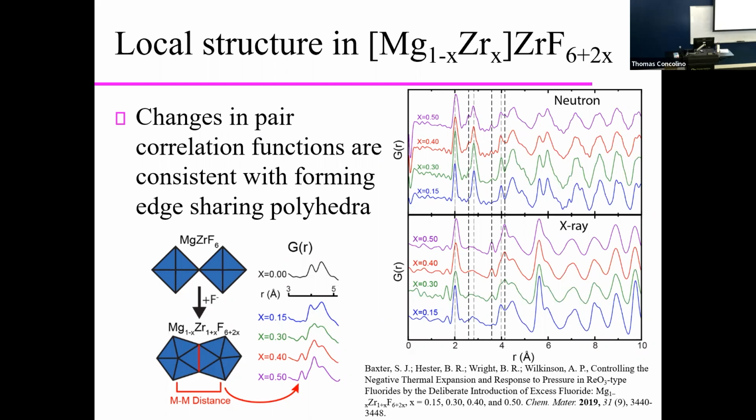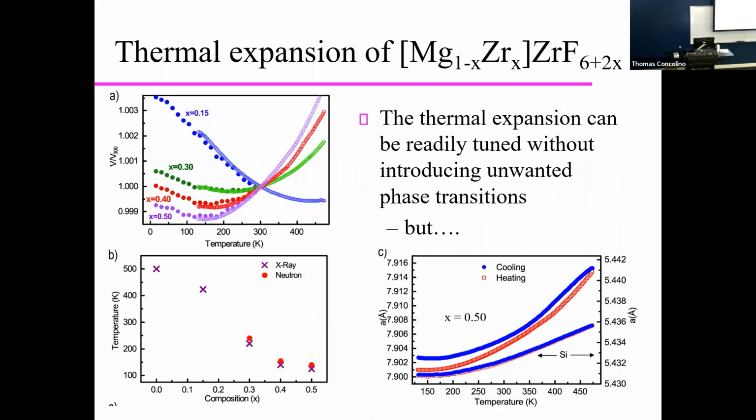And if you look at crystal structures of beautifully ordered, fully stoichiometric solids that contain zirconium-centered polyhedra like this, the center to center distance is, yes, 3.6 angstroms. We take that peak as strong evidence that we are converting locally corner to edge sharing polyhedra. What does that give us? Does it give us the control we saw?